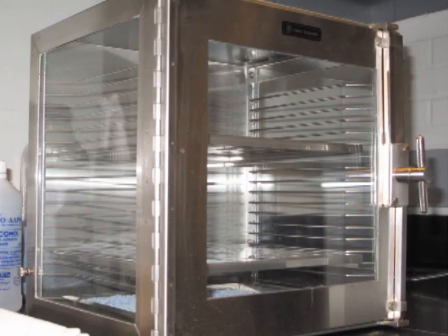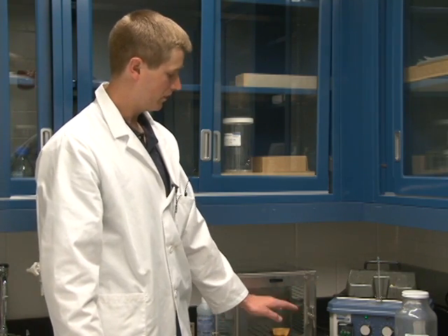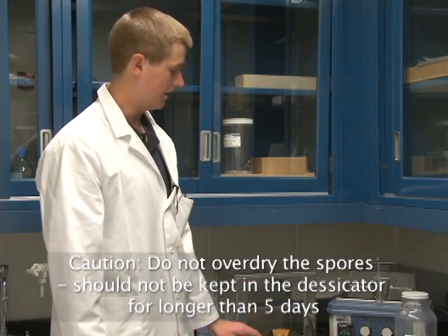In this case, this is a metal box that is airtight and has a desiccant that is anhydrous calcium sulfate. The anhydrous calcium sulfate is absorbing all the water inside this airtight chamber, which allows the capsules with the spores inside to be dried out. You don't want to keep the capsules inside the desiccator for longer than five days, because you can actually cause the spores to lose viability if they're too dry.